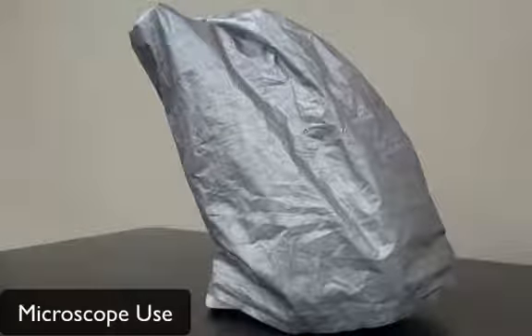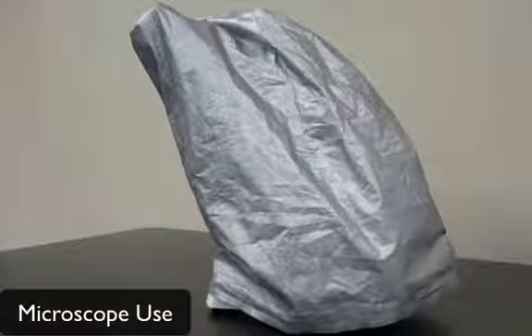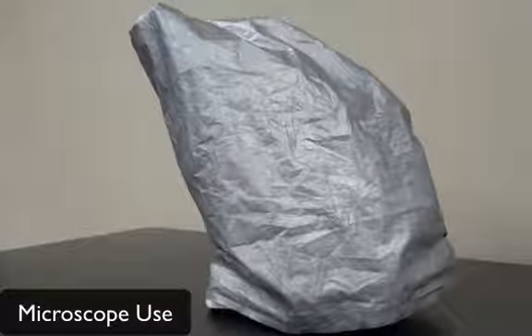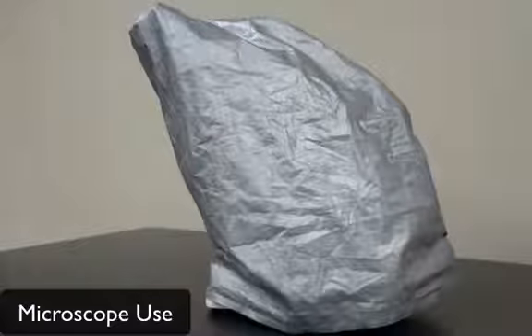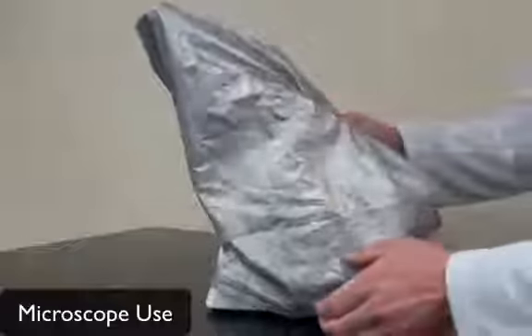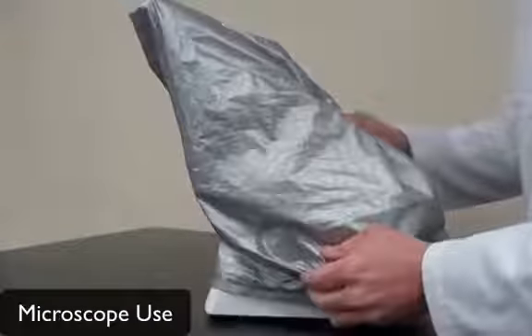Now, one thing that you'll note is that you'll see the microscope in the protective covering that the microscope has on it. This is just to protect from dust and other particles in its storage state. Now, when you move the microscope from wherever you may have it located in your lab, whether it's a cabinet or shelf, make sure you always grab it by the arm and the base when you carry it back to your desk. So you're going to set it down here.